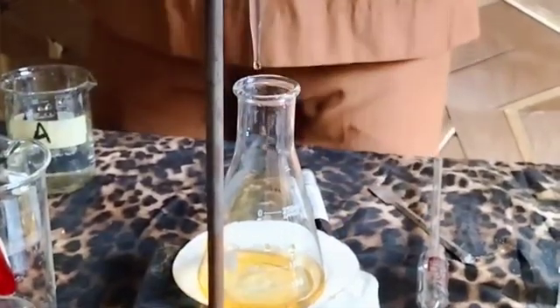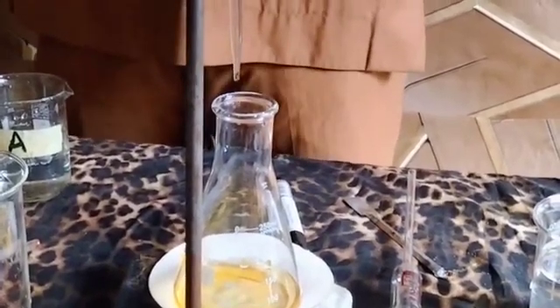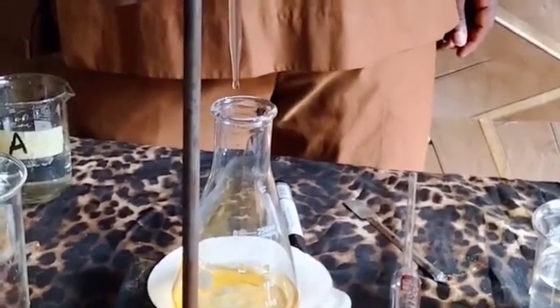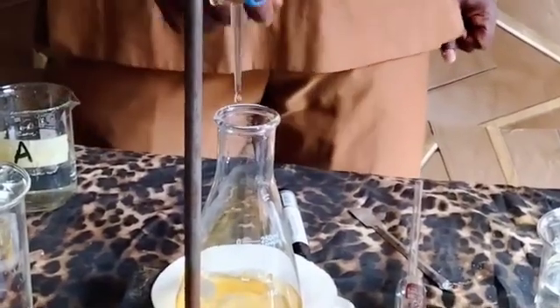While I tighten my burette. Okay. It's going little by little. It's still yellow in color. Then increase the pace a little and know when the color will change.